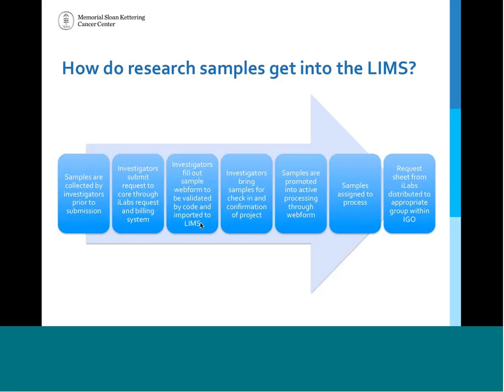So how do samples get into our LIMS? Initially, samples are collected by the investigator, and currently they're filling out an Excel sheet. We're shifting into having them fill out a web form. The web form is going to be great. It will give investigators instantaneous feedback as to the validity and the completion of their sample set. Then when they bring the samples physically to us, they're imported in the LIMS, and we check them into their first process.